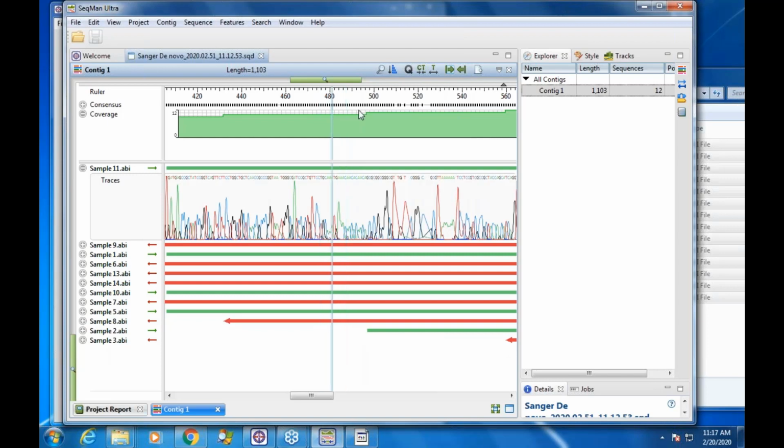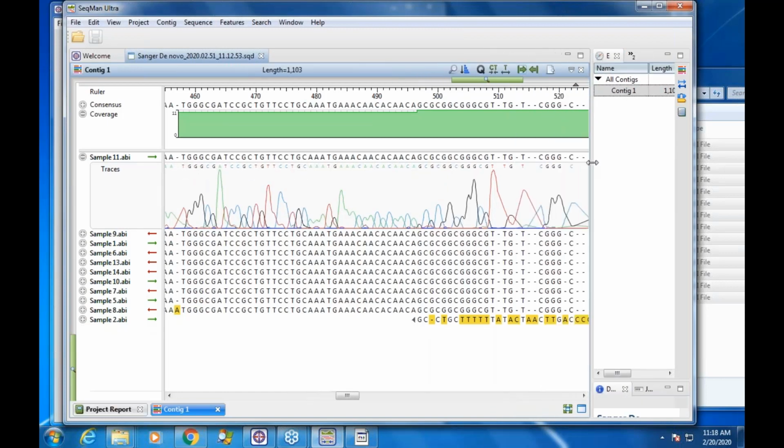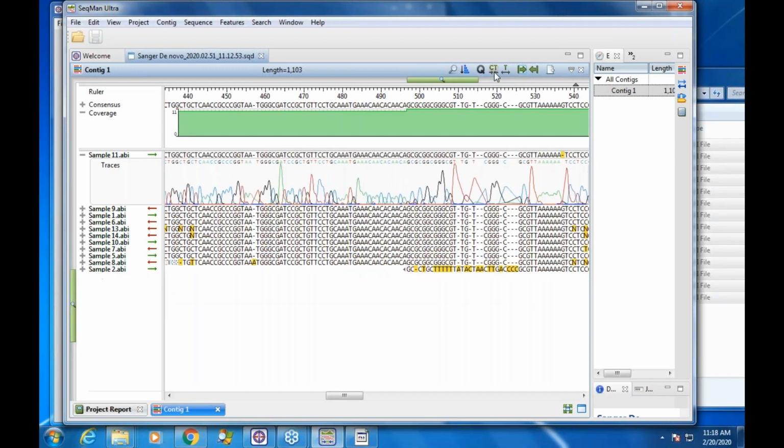Now, if I want to get back to where I can see my traces, there are compact text and restore default zoom buttons that just bring me back to a working zoom level. Now I have the resolution set for the webinar. We set it so it's fairly low resolution here, so everything looks kind of big. On a regular monitor, you can pack a lot more data into this view, but I can also use the compact text to get as much data into this view as is possible.